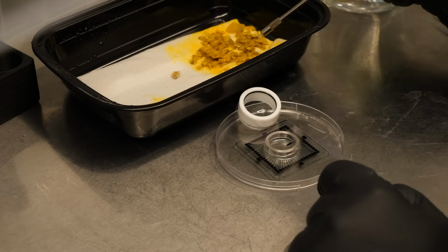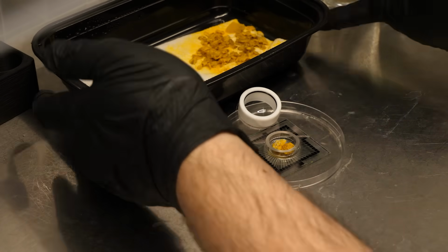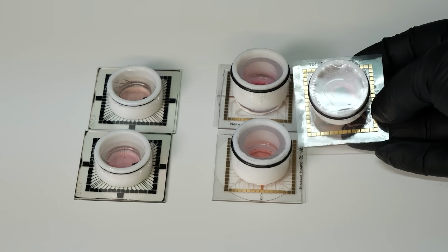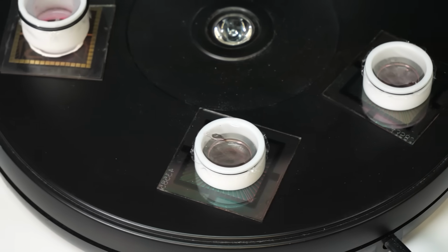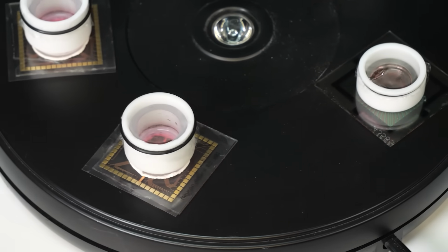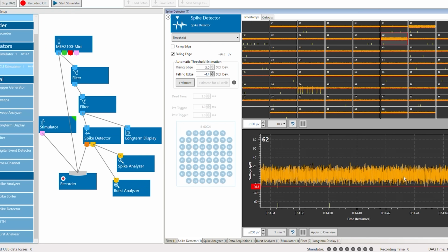Thankfully, they sent us a few spares, so we haven't used all of them for neurons yet. This means we could try one with Jerry. And of course, we have our homemade neuron arrays, which we tested in that video as well. Unlike the fancy Multi-Channel Systems ones, these are made from cheap PCB material stuck onto a glass backplate, but we showed in the last video that they work great for recording from neurons.